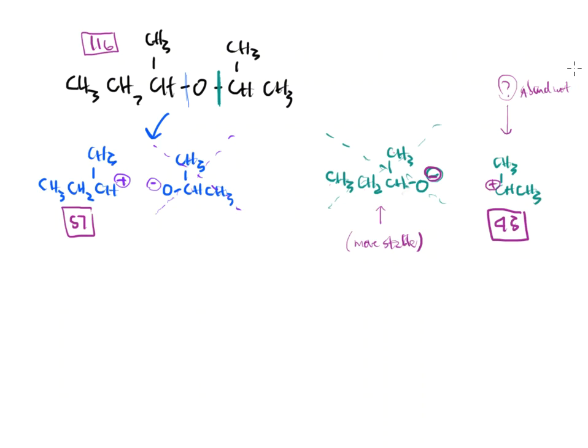We're not there yet because we still have homolytic cleavage that can come along. But this describes the 57 peak that we might see and the 43 peak that we might see. We can already make a determination that probably the 43 is going to be higher. And the reason is because the oxygen is with the largest piece in those two choices. It's bigger, it's greedier, it carries more electrons. The larger fragment can help kind of neutralize that out and make it a little happier without a problem.